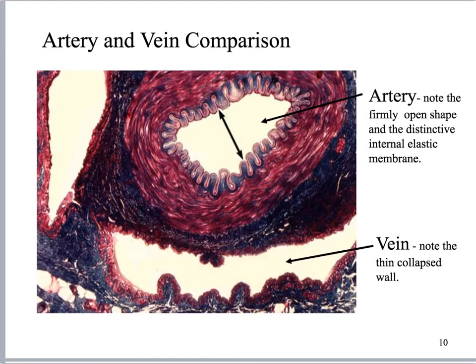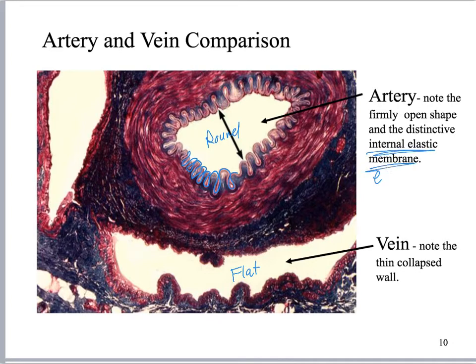This slide is great because it has an artery and a vein side by side. Here I have a rounded lumen on the artery, and a flat lumen on the vein. Up here I've got a really distinctive ribbon-like tunica interna because of the elastic lamina. I can see a super thick tunica media on the artery, but on the vein you can hardly see it — it's very thin. This is a really nice compare-and-contrast slide.